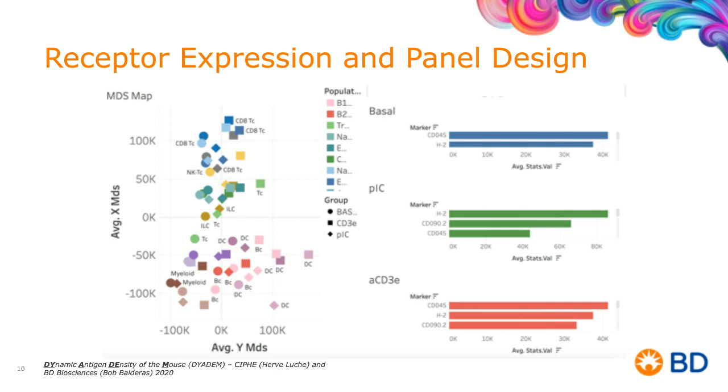And for all of the different receptors that we did, almost 300 of them, we can look to see whether it was up or down regulated. And it's almost the very first time that you get a composite look at all those potential activation markers that you might never have known were going to move.